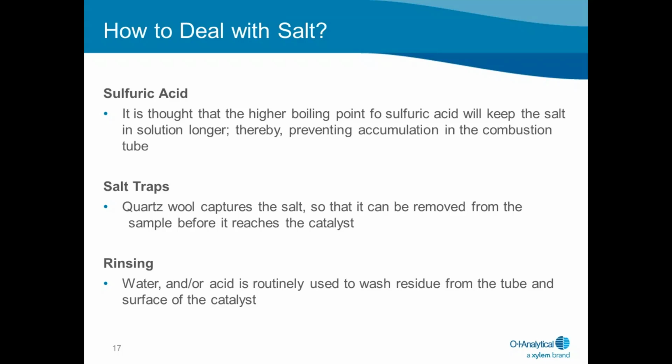Salt traps. Some schemes use a pad of quartz wool to absorb salt before it can reach the catalyst. Salt traps will ultimately clog and must be replaced. And once again, this does not prevent the possible devitrification of the combustion tube itself. Rinsing. Rinsing with water or acid will definitely have a positive effect on the combustion tube and catalyst. This is highly recommended as some, but not all, of the salt may be washed out of the combustion tube.